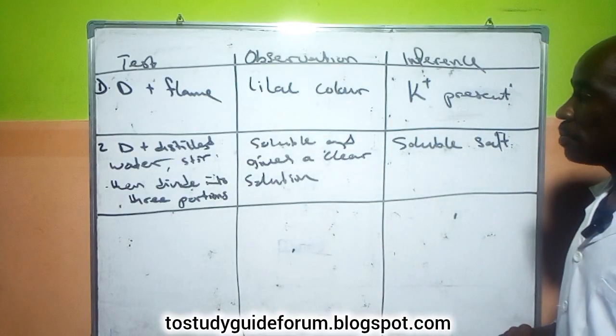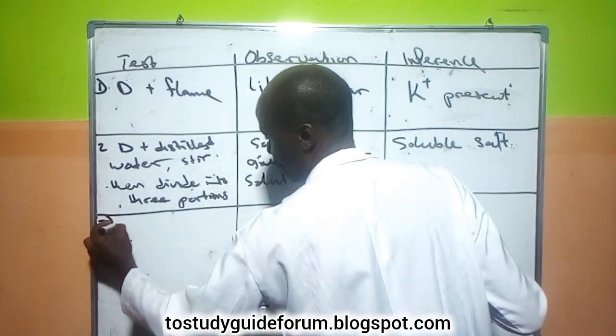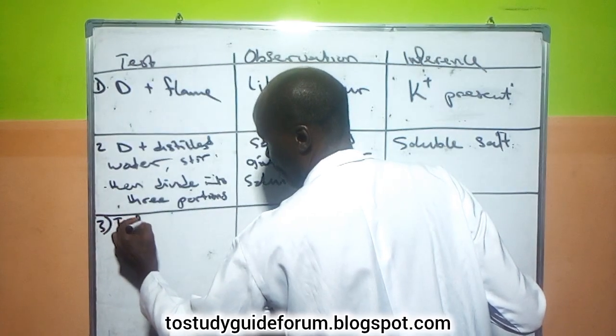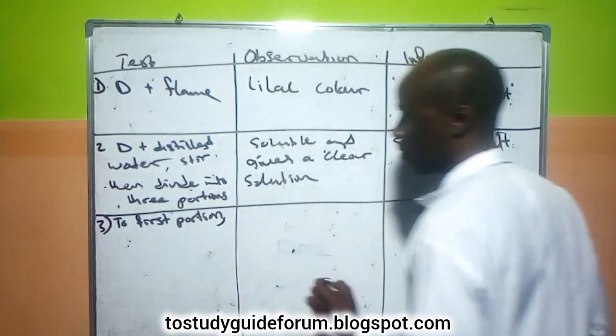So now the next one we're going to do is to the first portion. What do we do with the first portion?